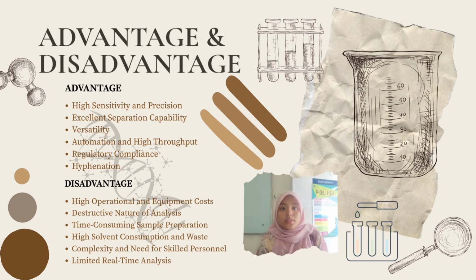For disadvantages, these analyses usually have a high operational and equipment cost, where the instruments require a significant initial capital investment and maintenance. Mostly, chromatography is destructive to the sample during the detection process, where the specific sample injection cannot be recovered for further biological testing. It also requires time-consuming sample preparation, which can introduce human error.